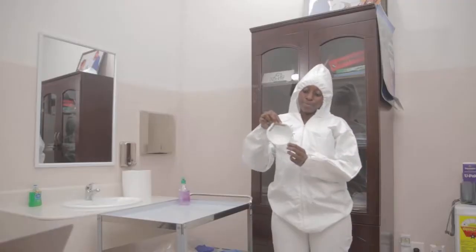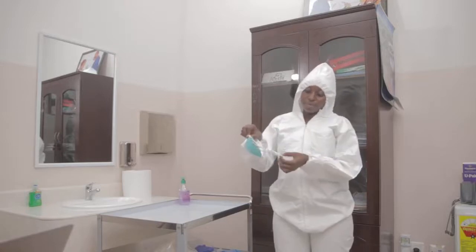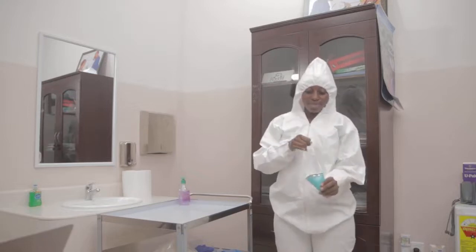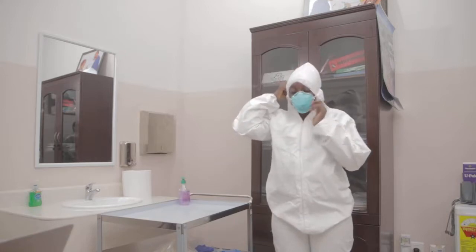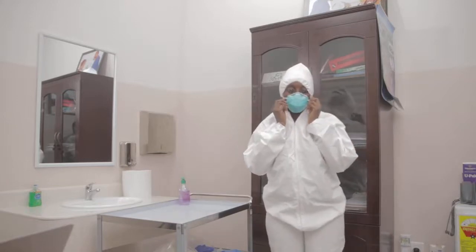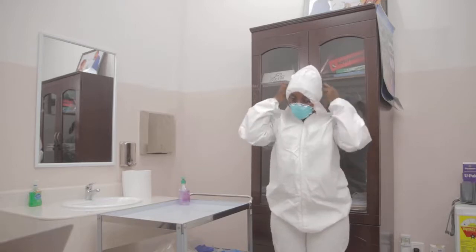Wearing of respirator. Cup the respirator in your hand with the nose piece at your fingertips, allowing the headbands to hang freely. Position the respirator under your chin with the nose piece up. Pull the top strap over your head, resting it high at the back of your head. Pull the bottom strap over your head and position it around the neck below the ears.